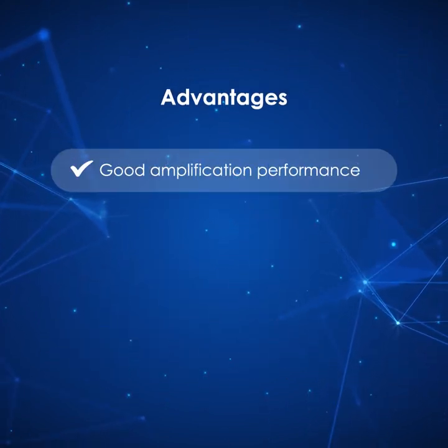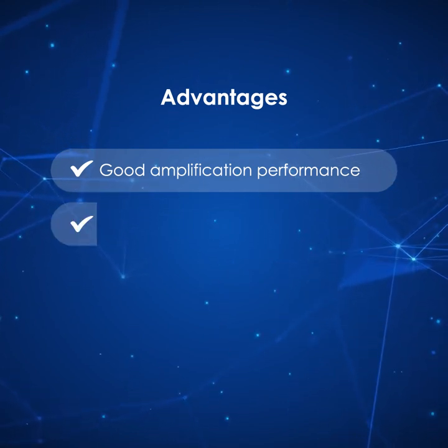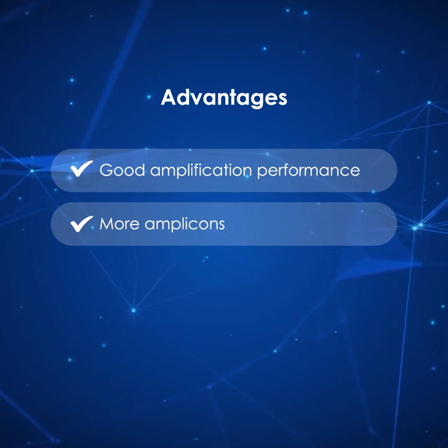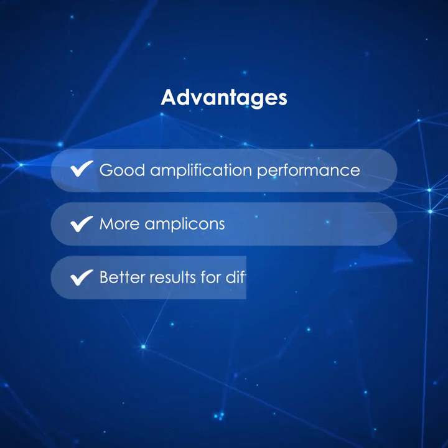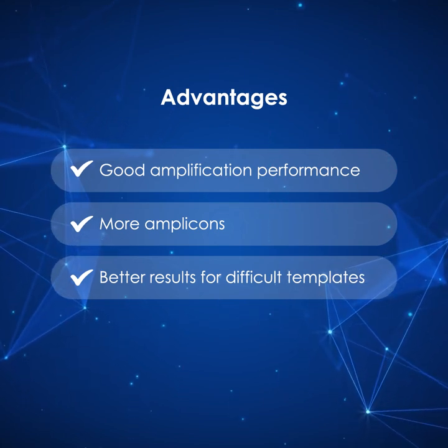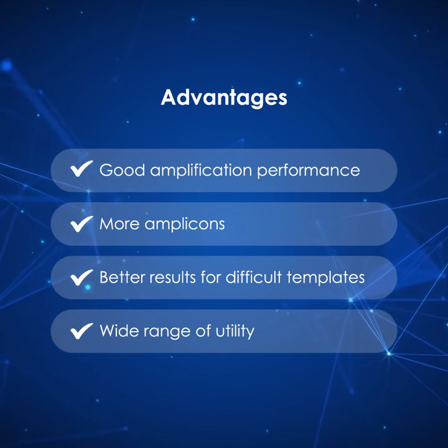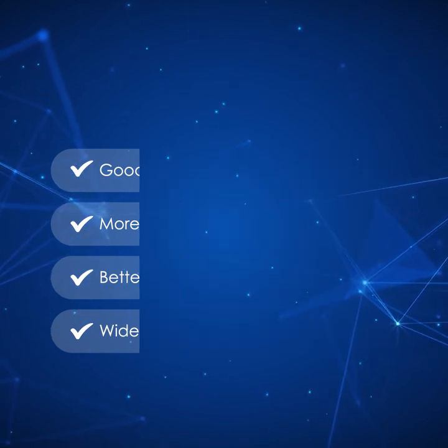Advantages: the technique is highly specific, sensitive and accurate. It can give a high amount of amplicons with greater specificity. It offers amazing results for difficult templates like high GC-rich or longer templates. It's useful for the amplification of low-abundance genes, alleles or DNA sequences.